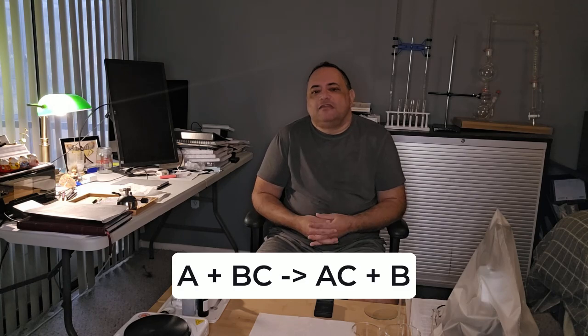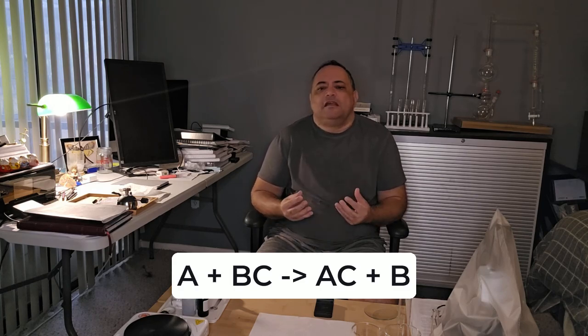A single displacement reaction is a reaction where one element trades places with another element in a compound. In these kinds of reactions, one element displaces another from a compound to form a new compound and the displaced element. Generally, the more reactive element displaces a less reactive element in a compound.